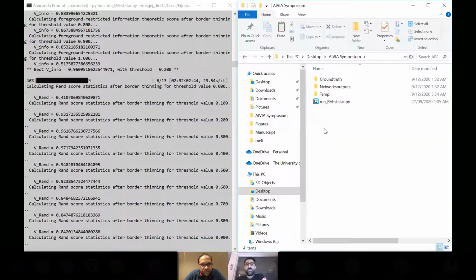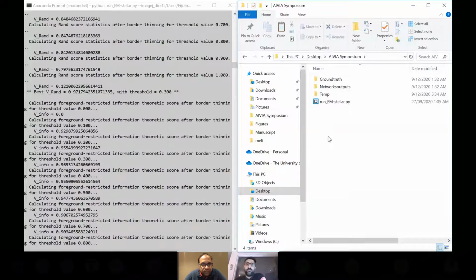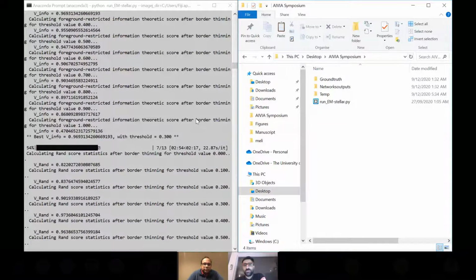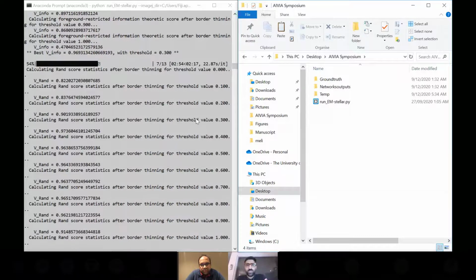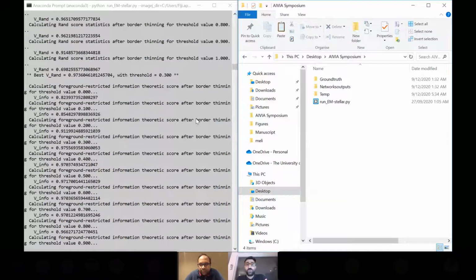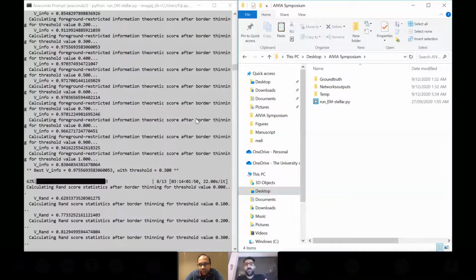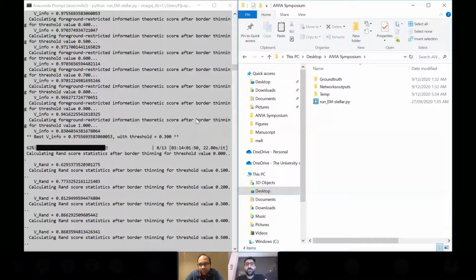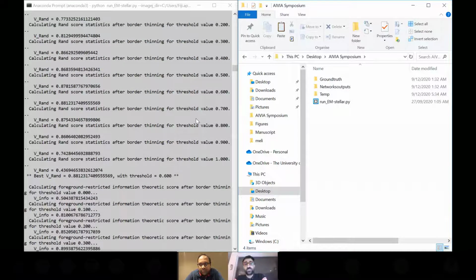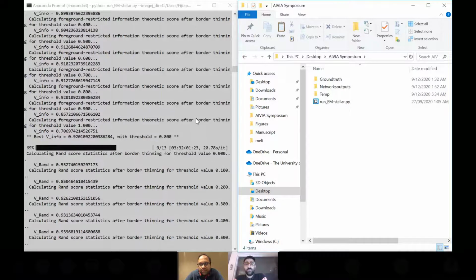VInfo and VRAND score. We were interested in VRAND and VInfo score, and in the paper we really emphasized and highlighted these two metrics because they give a better perspective from the over and under segmentation perspective, which is pretty important in some domains, including neuroscience, and also in our application, cardiomyocyte segmentation, because sometimes we are interested in segmenting mitochondria and myofibrils and Z-discs in one place, and over and under segmentation there is really, really important.